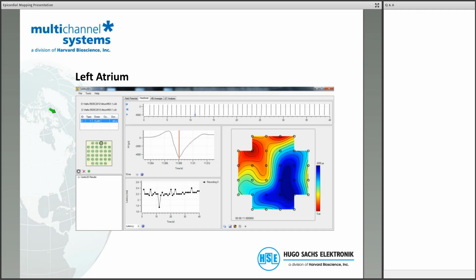So let's now have a quick look at a recording that was indeed done on an isolated heart. We are looking here at data from the lab of Lior Gepstein at the Rappaport facility at the Technion in Haifa. And you see basically the same plot as before. So you have again your long-term recording, and you see this heart is beating in a very regular way. We look again at one particular electrode, have the detection timestamp, and you have your latency plot here.